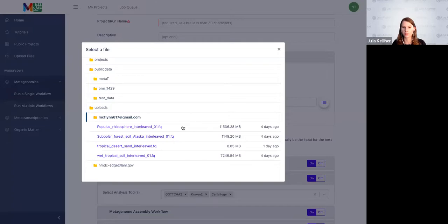Not the entire group of you, but I know some of you that we reached out to specifically do a lot of rhizosphere science, for example, or some soil metagenomics. And being in New Mexico, I know we have a lot of sand, so thought we would include that one as well. And then we have a couple of different soil samples to potentially compare as well. So some of these are 10% data sets. And then I think this one, and Mark, correct me if I'm wrong, but I think this one was too small to subset, but these ones I think we did subset. So these are the 4 that I'd recommend choosing from.